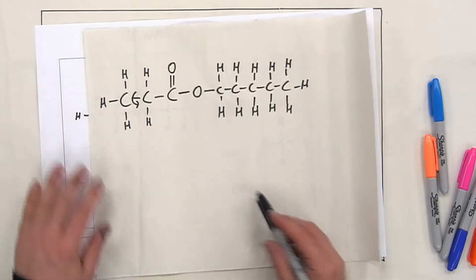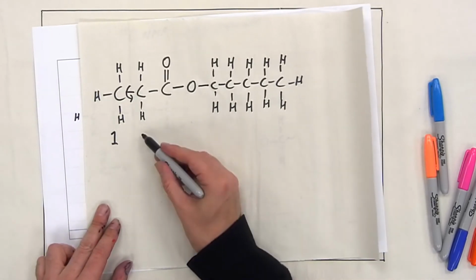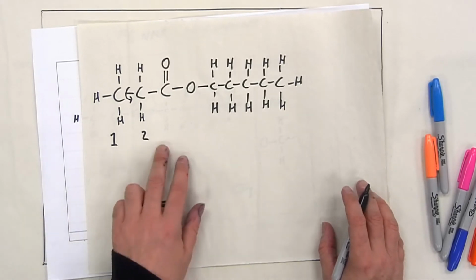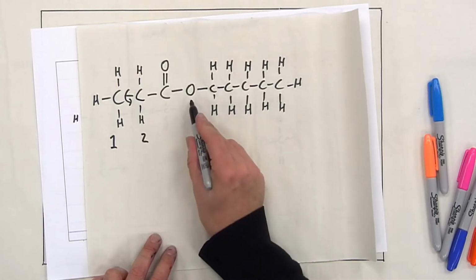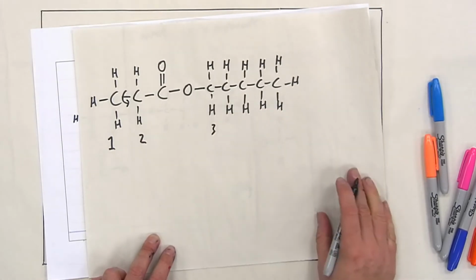So therefore, this is one chemical environment. The CH3 is one chemical environment. The CH2 adjacent to that is a second chemical environment. So that's the first two. Let's just move along to the pentyl branch. Okay, so this is a CH2, but it's a different CH2 because it's next to an oxygen rather than next to a carbonyl. So that's a third chemical environment.